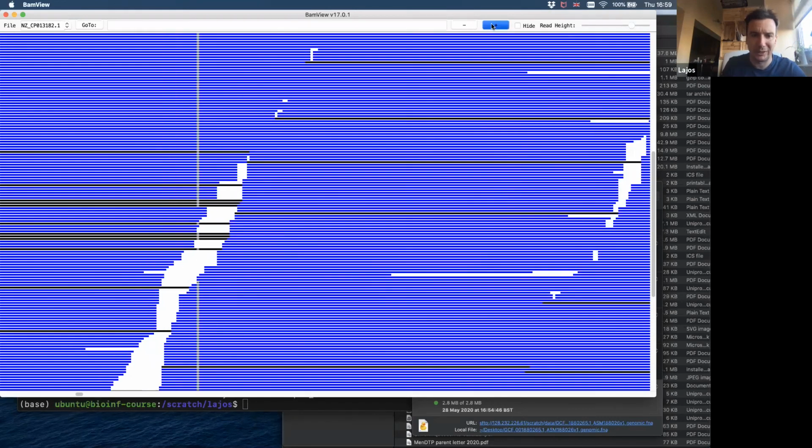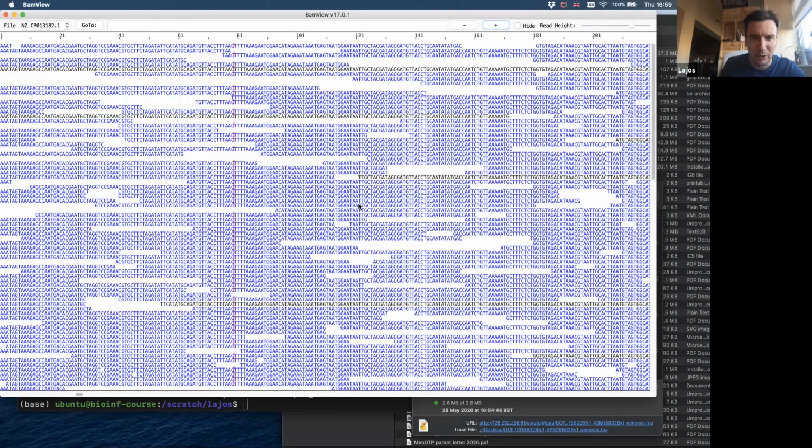And if you go in, oh, it's probably an insertion. It's not even a, yeah, it's an insertion, sorry. So there is an insertion here compared to the reference sequence. And that's why you have this vertical line here. Let me check if we have.